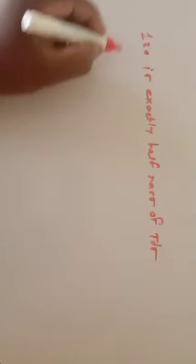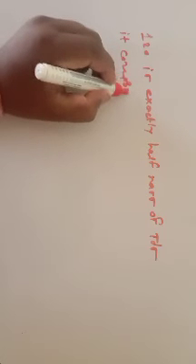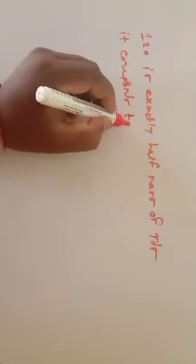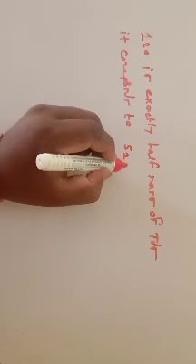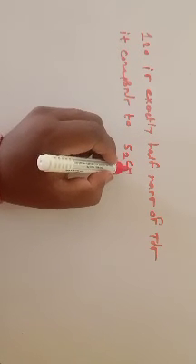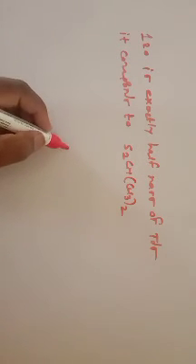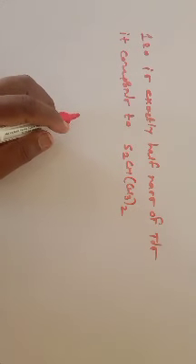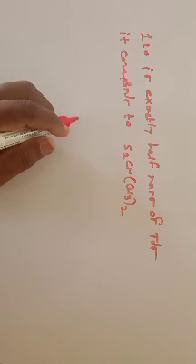And it corresponds to S2CN(CH3)2, that is the dimethyl dithiocarbamate ligand.